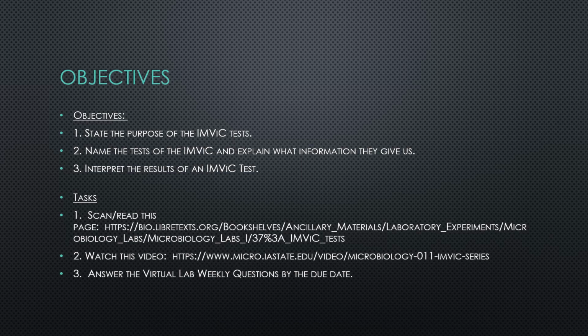As you're watching the video and as you're reading the information at the link I've provided, you should probably take some notes. You'll want to record, for example, what's the purpose of each test, what medium is used, and what information we get, plus your possible results. It's really good if you can put all of this into a table that you can refer back to as you go through labs over the next few days.